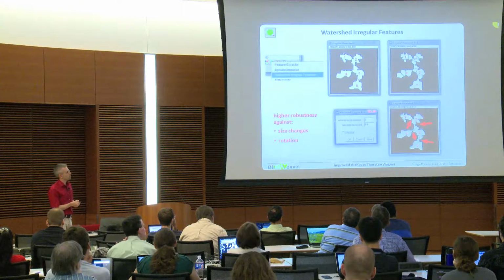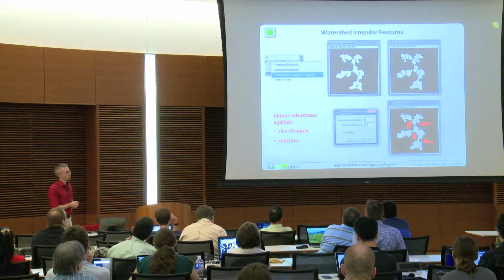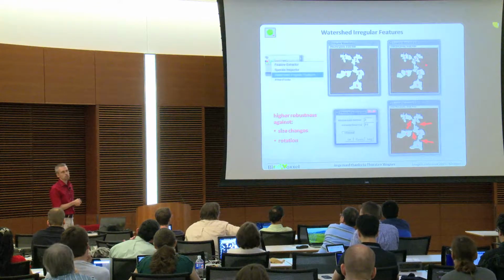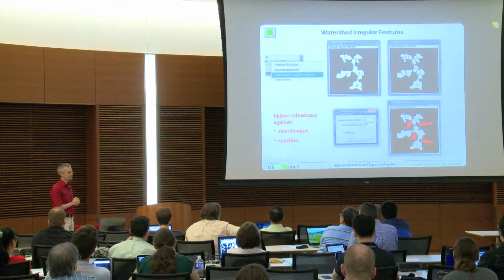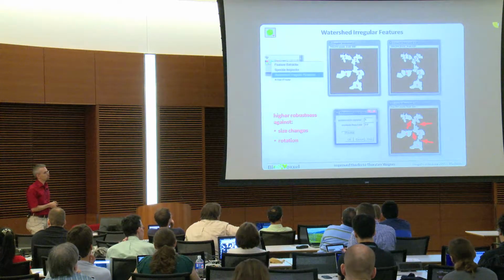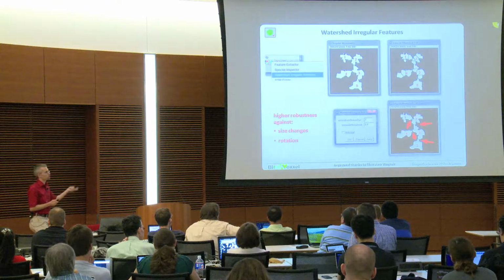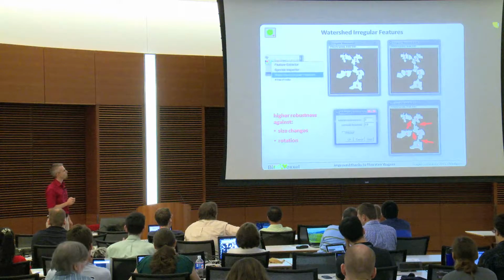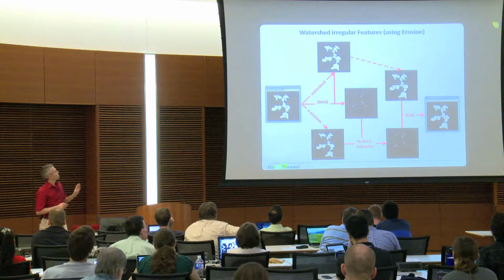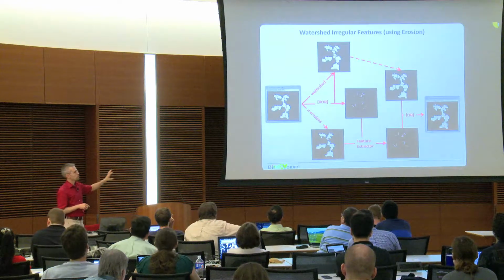Depending on what you key in, we can separate those ones by not over-fragmenting them. So you cannot get more separations than in the watershed, but you can get fewer separations. And the convexity is simply a second opportunity. If you key something in for the convexity, it ignores the first option of the erosion, so either or. I don't want to confuse you, but that is basically how it works.